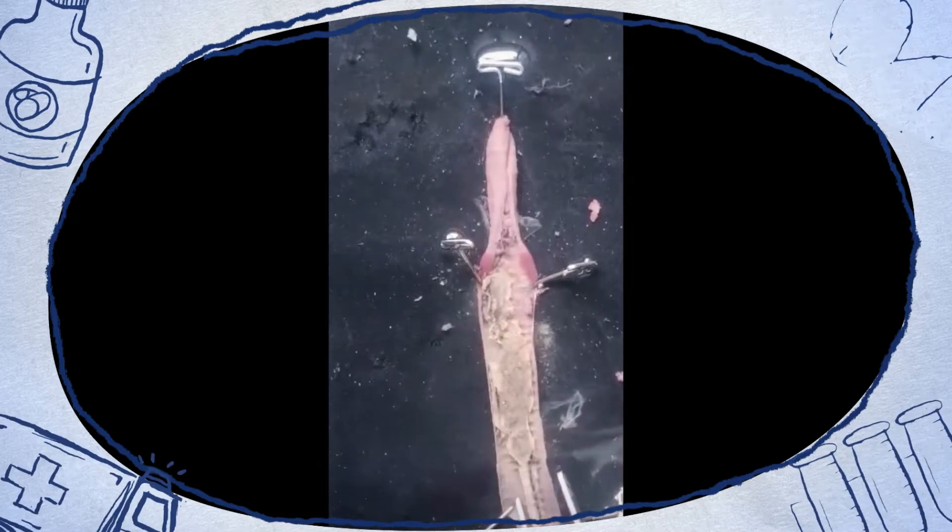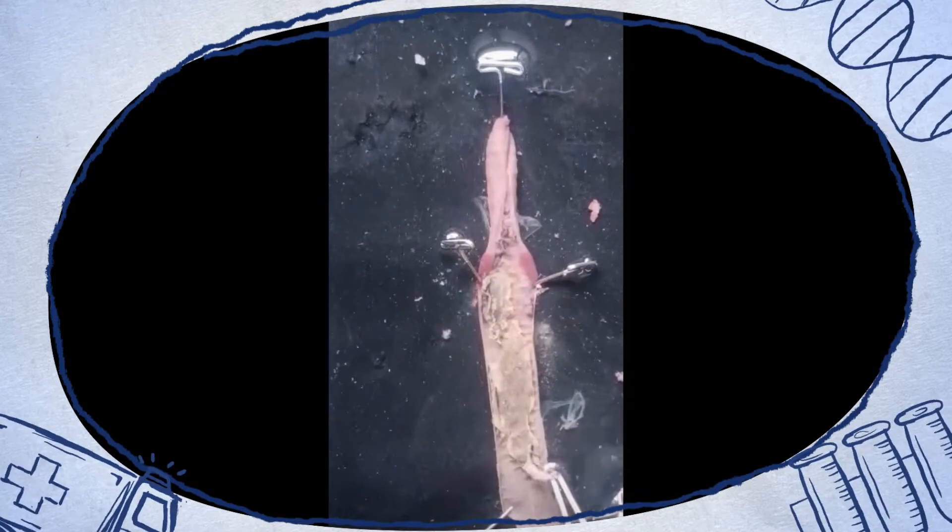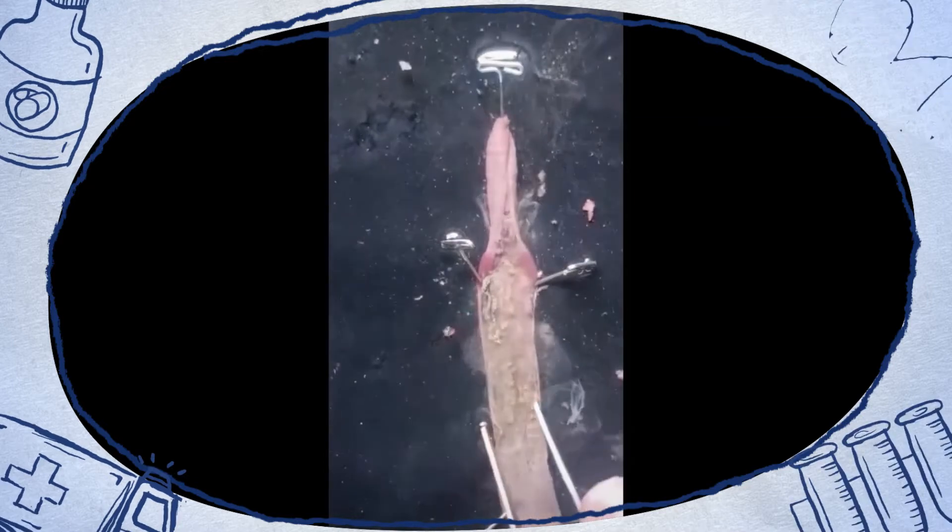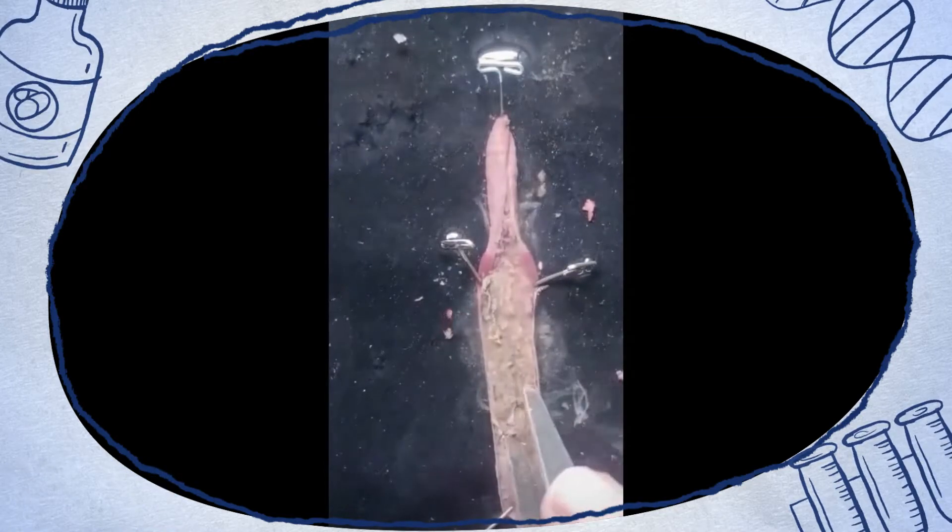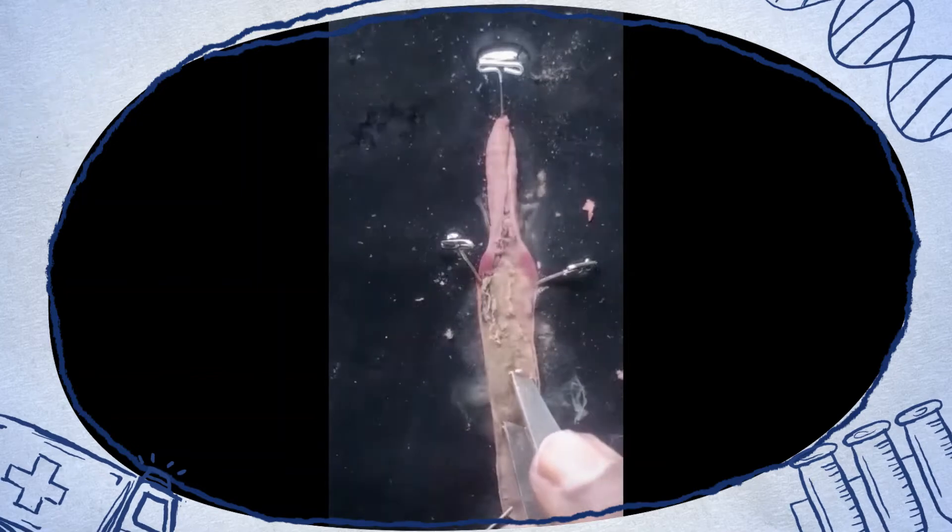The nervous system of the earthworm is located on the ventral side. Hence, we can remove the digestive tract.